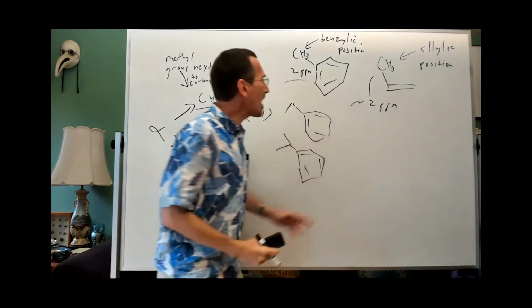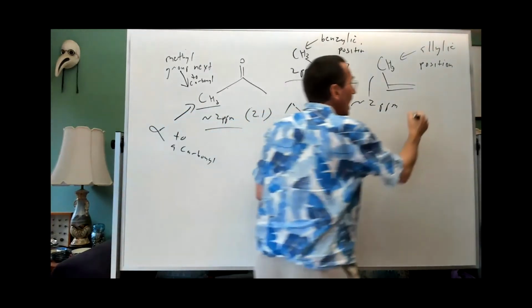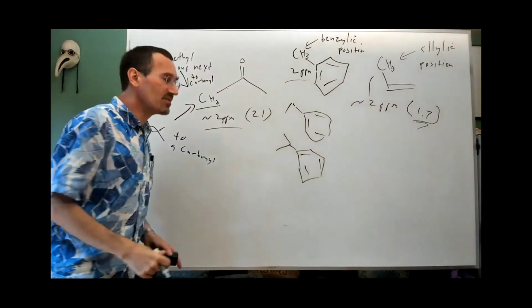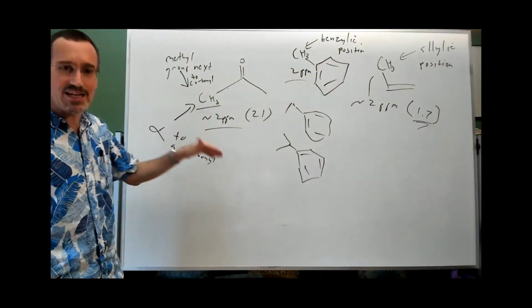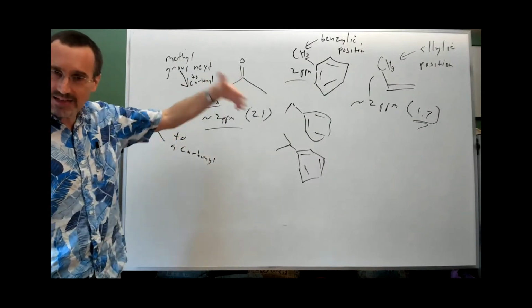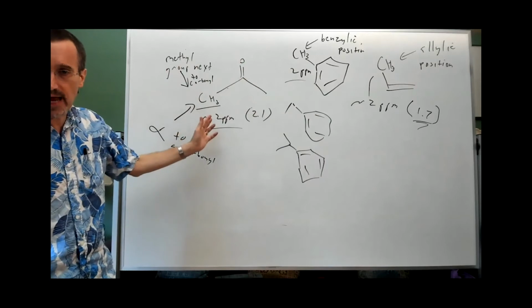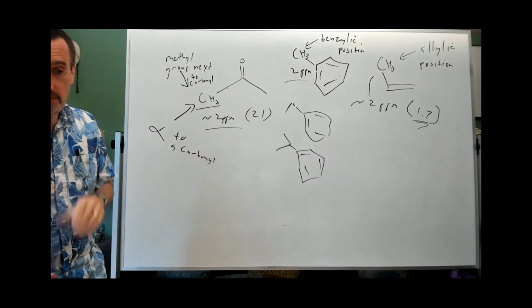If you can go ahead and keep a little more information in your head, I'd say calibrate, it's going to be maybe more like 1.7 instead of 2. But again, if you can't keep that level of detail in your head, knowing it's not going to be at 0.9 ppm, that methyl group is going to be about a part per million downfield of where it would otherwise be, is very, very useful.